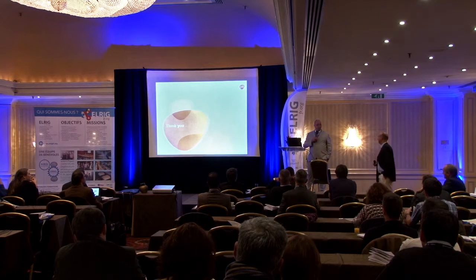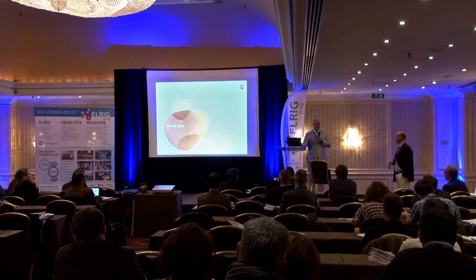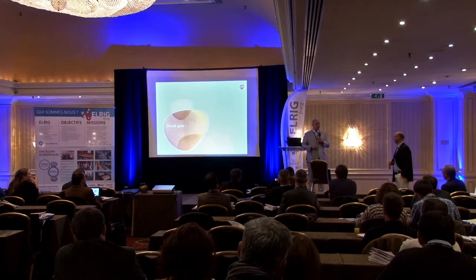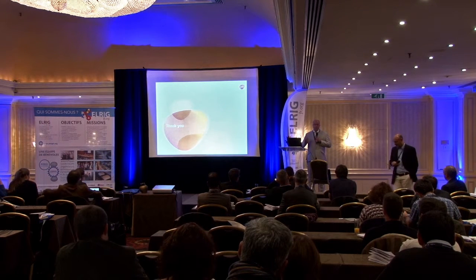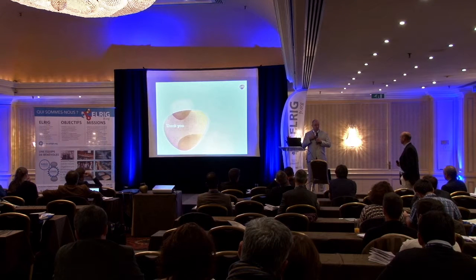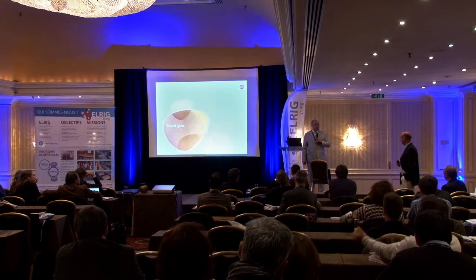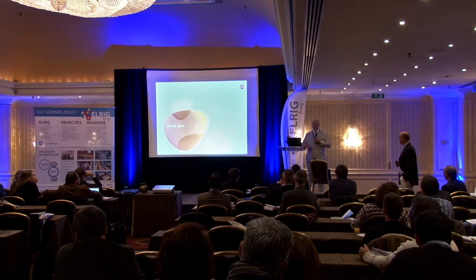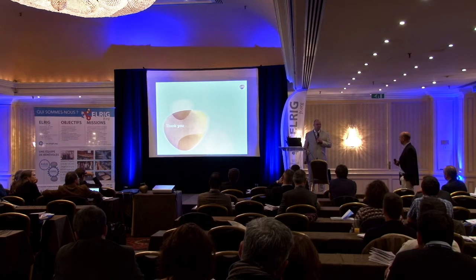First we will analyze the request with them, depending on what they want. And we have different solutions. If it fits the configuration that we have for the hardware, it will be very easy to develop the reading with them. And we have 2 possibilities. We can develop the image analysis process by ourselves, or we can ask our partner to help us if we have something very specific to develop. But this process is very well known. We have used it for several years.